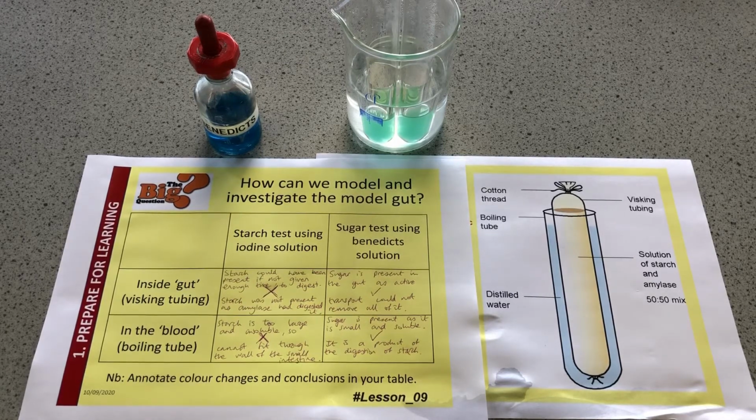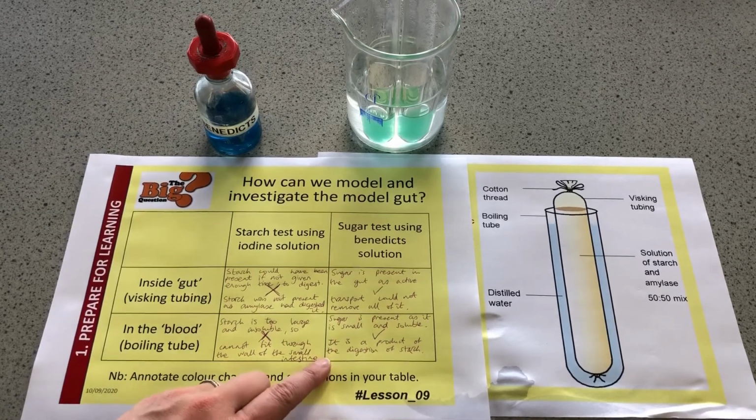It would have been okay if we did find some starch there. It would have just meant that it hadn't been broken down yet. The sugar test, the Benedict's test, was to see had the soluble small sugar molecules made it into the blood, and yes they had. The sugar was present in the blood because it's small and soluble, and it is the product of the digestion of starch.